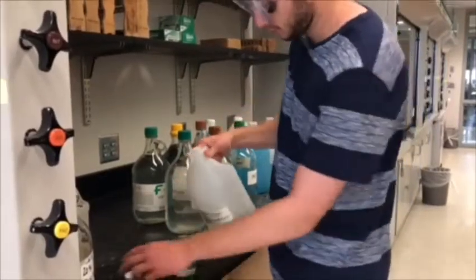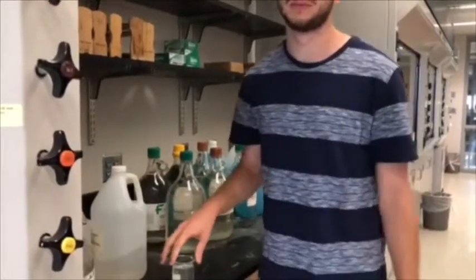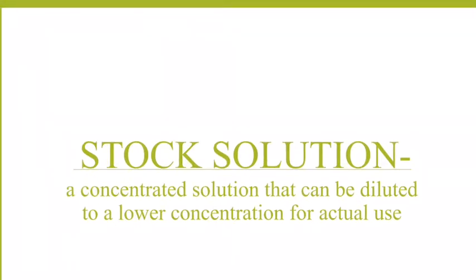A stock solution is a concentrated solution that can be diluted to a lower concentration for actual use. To dilute a solution is to make an original solution weaker or less concentrated, generally with water.